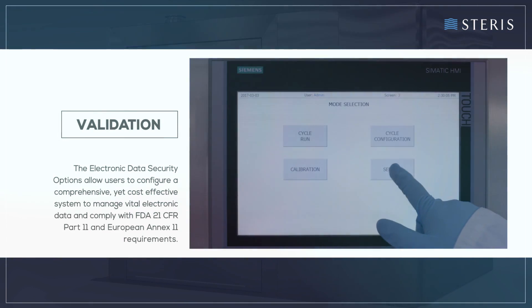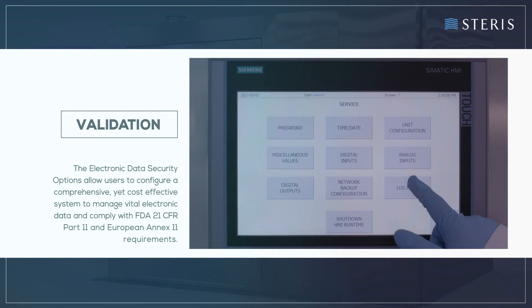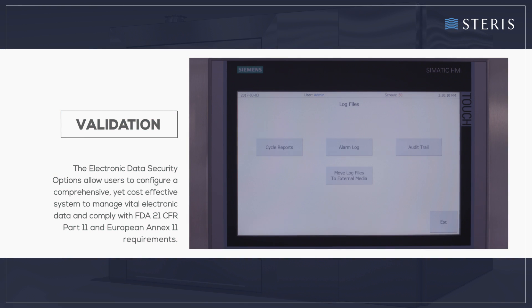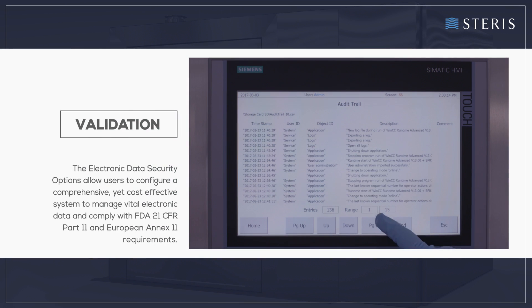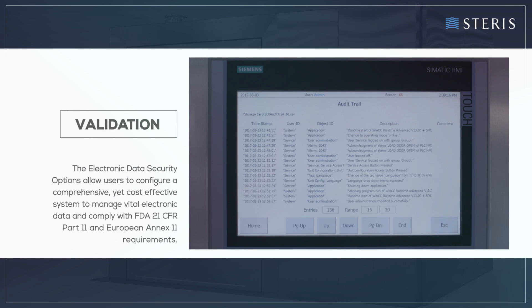The electronic data security options allow users to configure a comprehensive, yet cost-effective system to manage vital electronic data and comply with FDA 21 CFR Part 11 and European Annex 11 requirements.